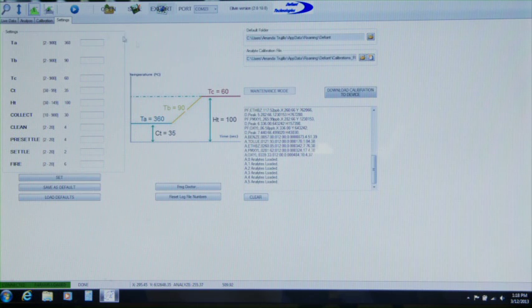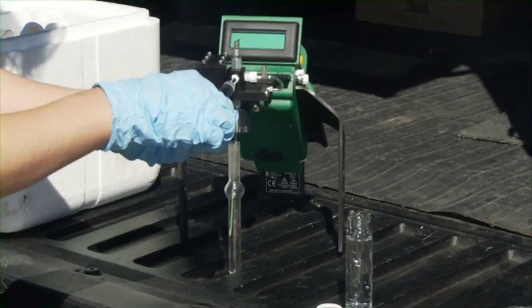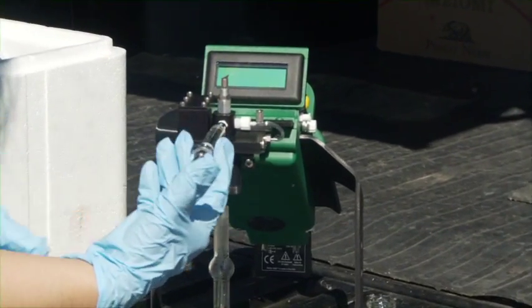Once the calibration is completed, it is downloaded to the Frog 4000 to enable field operation independently of a computer.